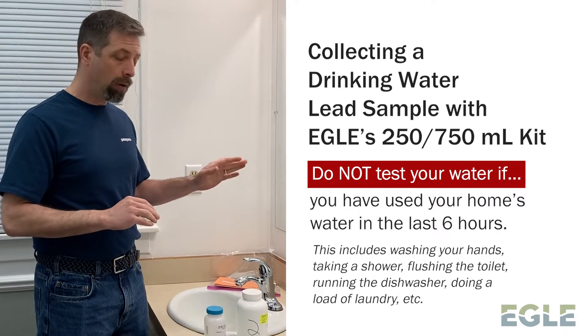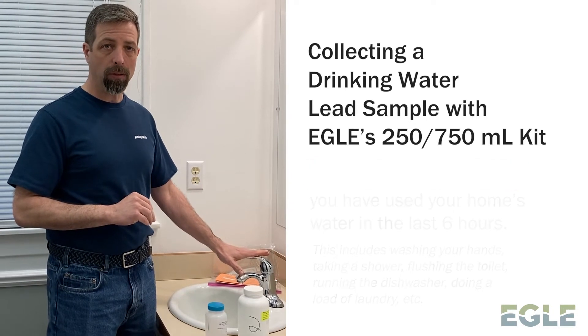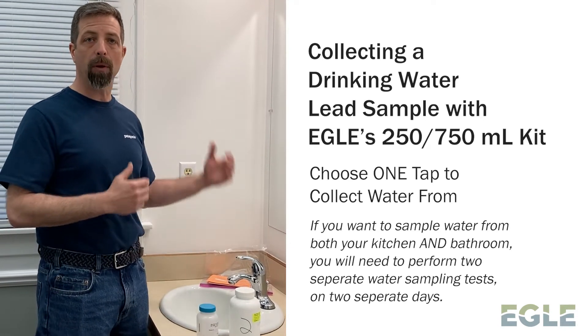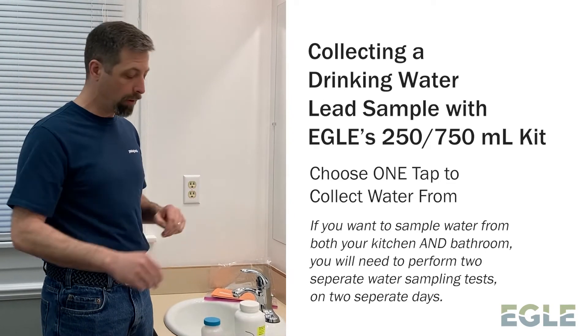This works really well right after you get up in the morning, or right when you've got home from work if you've been gone and the house has sat stagnant for that whole time. Right now my house has been sitting stagnant for at least six hours. I'm going to use a bathroom tap — you could use a kitchen tap as well. If you want to do both a kitchen and a bathroom, you'll have to do them on two separate occasions so that you can stagnate the water each time.